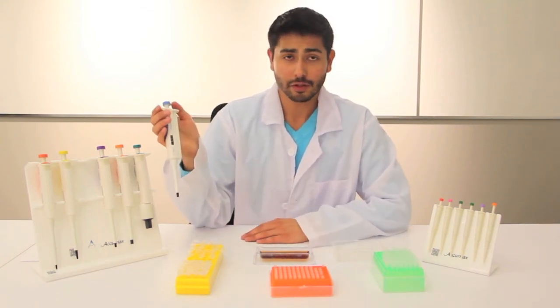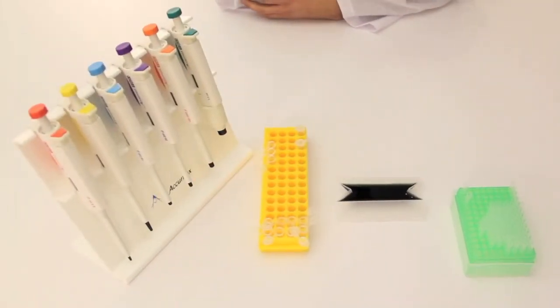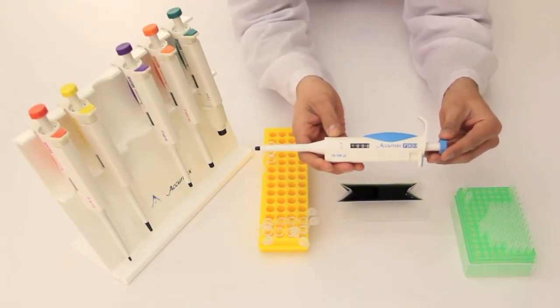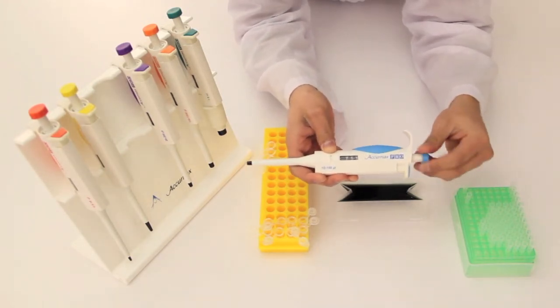AcuMax Pros also feature the ISO 8655 certification. To demonstrate the AcuMax Pro pipettes, we'll be using the 100 microliters pipette. We're going to set this pipette to 50 microliters by turning the knob until the micrometer reads 50 microliters.